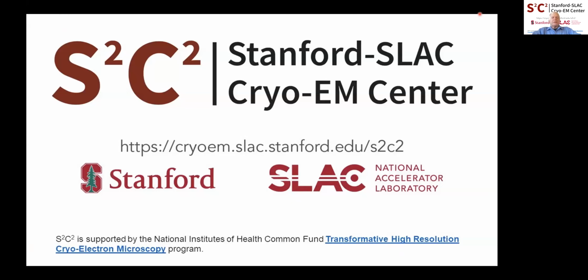I'm Mike Schmidt, and I'm one of the co-directors of the S2C2 Stanford SLAC cryoEM Center. We have available 3 Krios microscopes and access on another one, plus a Talos.